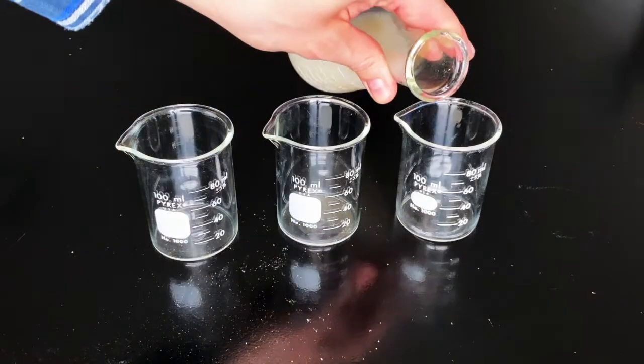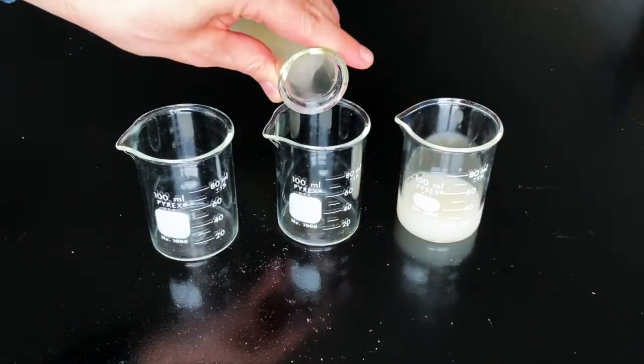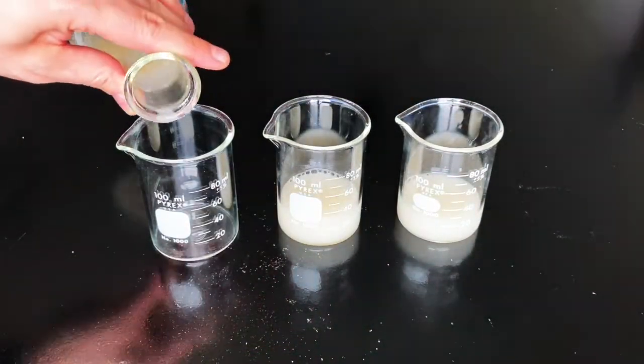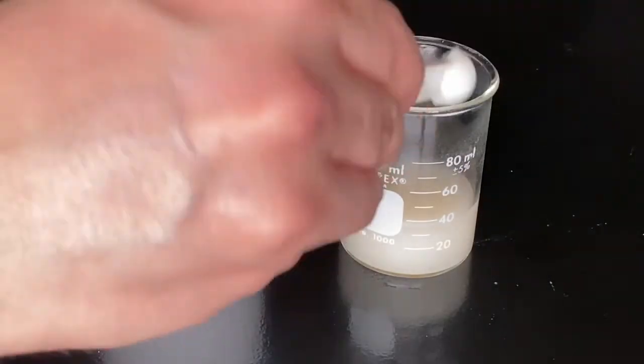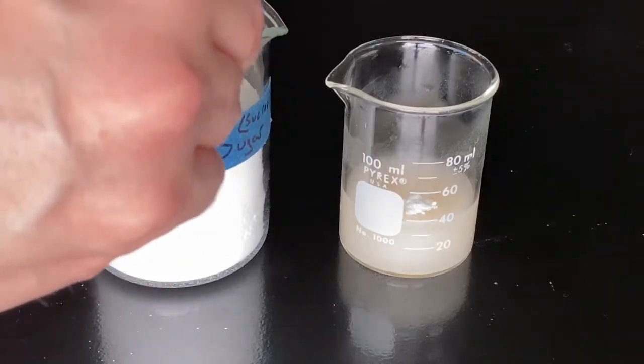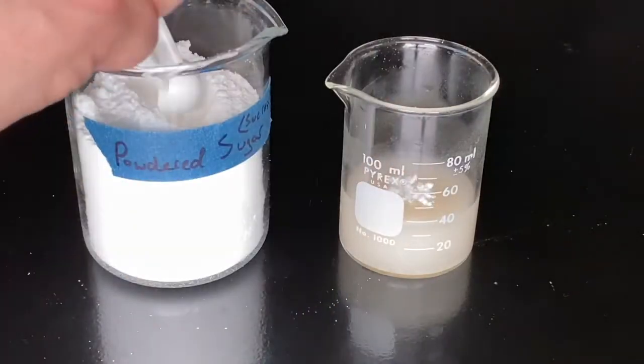If your experiment is intended to test different kinds of sugar, then divide your yeast solution evenly into several different beakers first. Then, you can place different kinds of sugar in each beaker. Make sure you add the same amount of sugar to each beaker to control your variables.